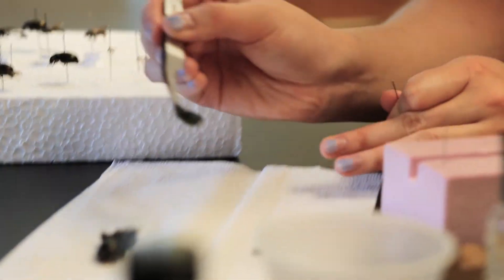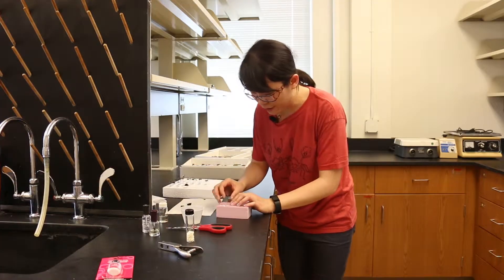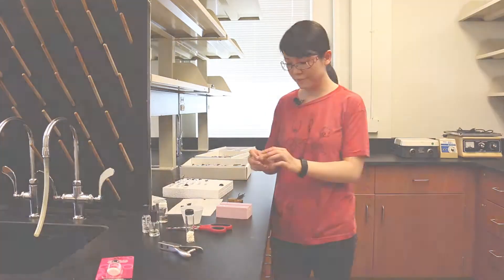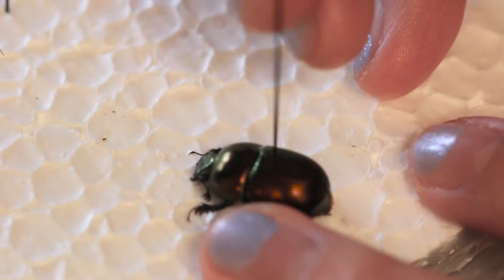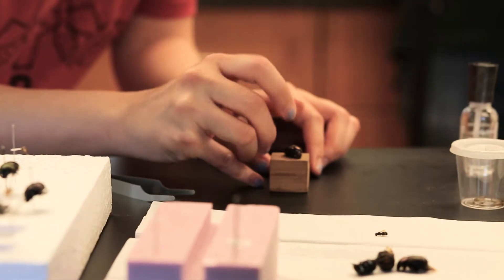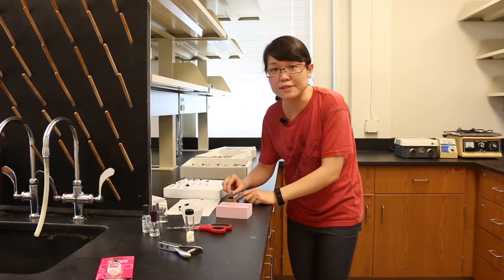Then first step, we use forceps to pick up a beetle and set it up gently. We select the right size of pins — there are different sizes depending on the order or size of the insect. There are also different spots on the body of insects that we pin through. We pin through the beetle gently but don't go all the way through. Then we pick up the pin with the insect, put it through the hole of the pinning block, and push all the way to the bottom.